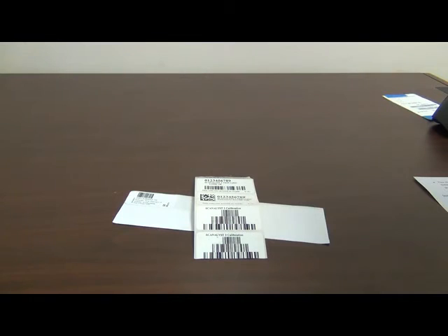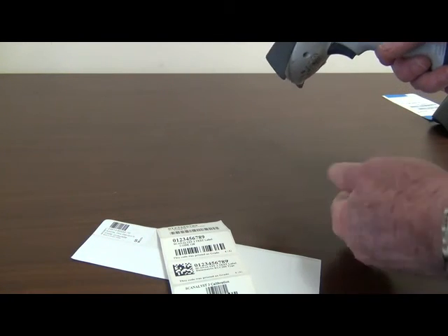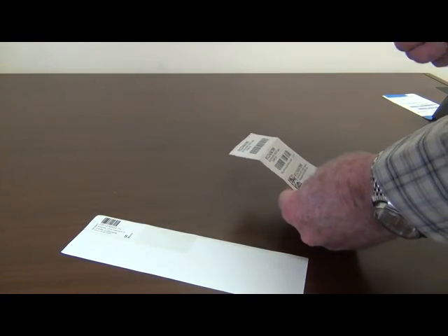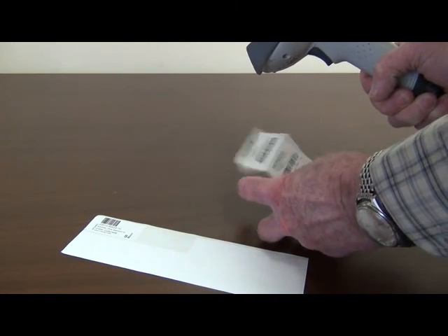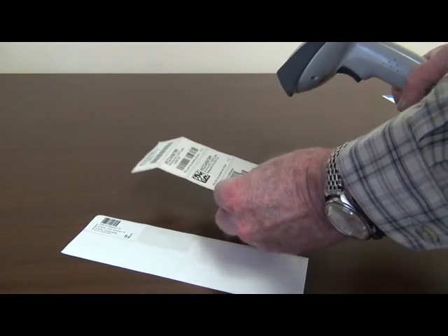Another thing that might help is that if you want to do things like the supermarket does, where they have a fixed scanner in a fixed position, you can do that. Almost all of these scanners come equipped with a thing called presentation mode, where when you put a barcode in front of them, it recognizes that there's a barcode there and proceeds to scan automatically. So imagine this in a fixed cradle, and you just put your barcodes in front of it. Let's put 128 in front of it. So it read it. I didn't push the button, by the way.